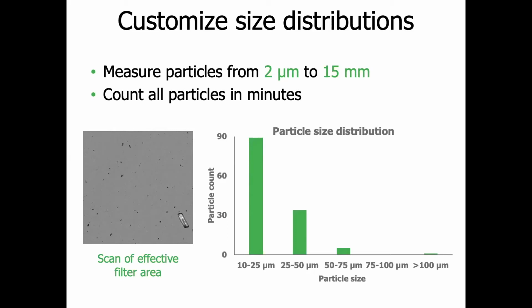material. You define how many and which particles to analyze based on the size and morphological parameters Hound measured during particle counting. In our example here, you could define that only the one particle greater than 100 micrometer could be analyzed, or all the particles in the 25 to 50 micrometer bin, or even define a certain elongation or fibrosity threshold so that only particles that have certain aspect ratios or fibrosities are analyzed.